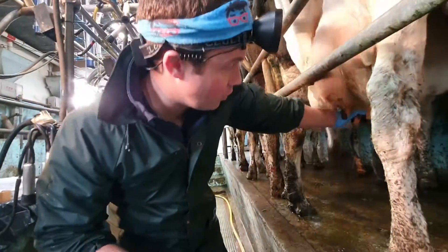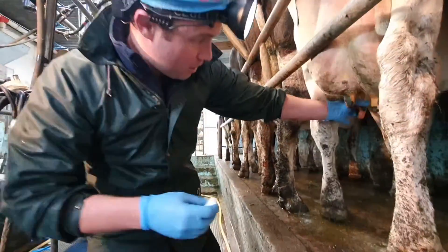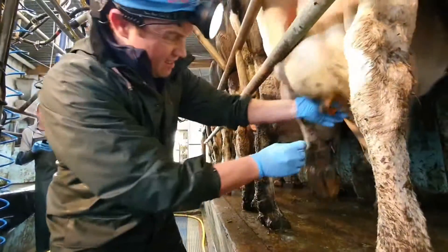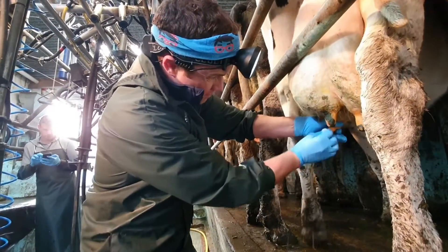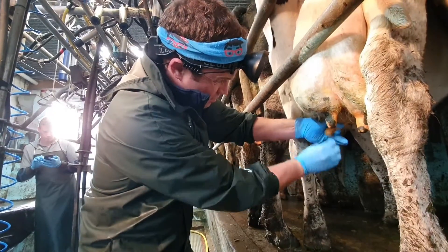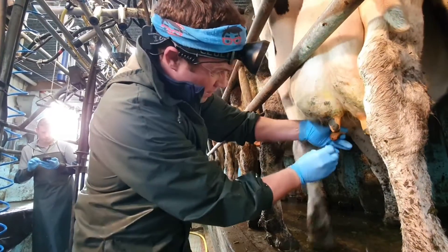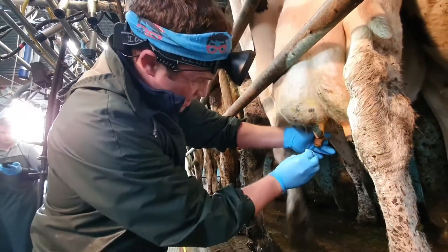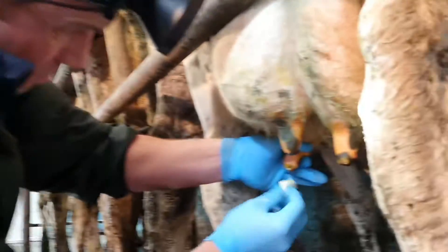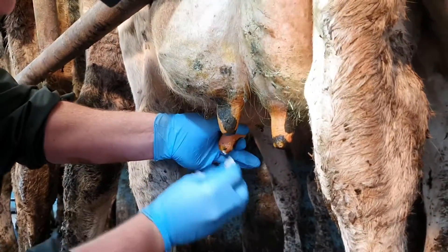The first thing I want to do - she's going to be a bit sore in this quarter - is really just clean the teat end. You can see how sore she is, but if I want to take a proper sample, I've got to get that teat end absolutely scrubbed and clean before I take a sample. She actually has warts in that teat as well. I've got it as clean as I can.